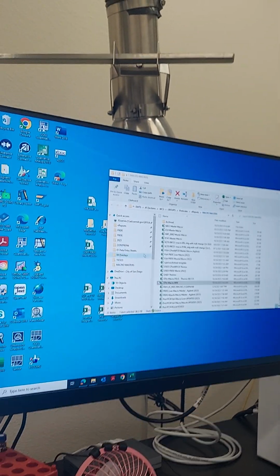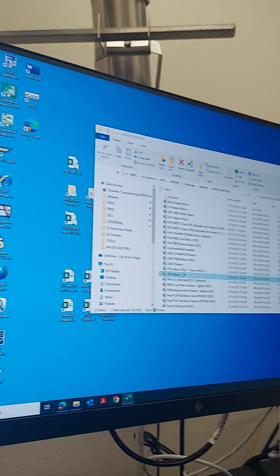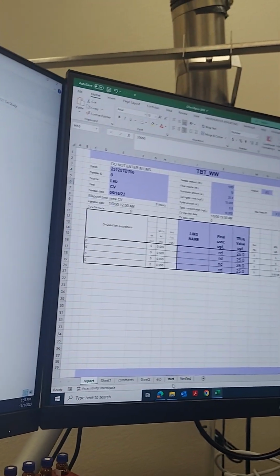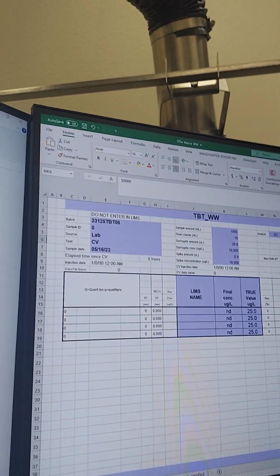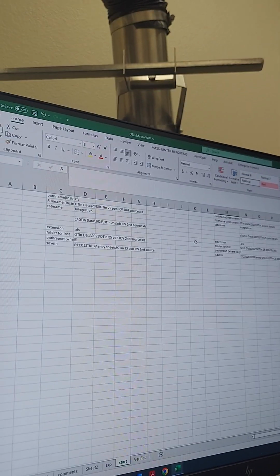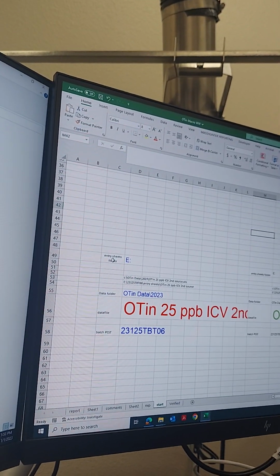Okay. Is it opening? Alright. Do you need to cut and paste, or how do you put that information here? We filled this out. Okay, so the entry sheets folder.